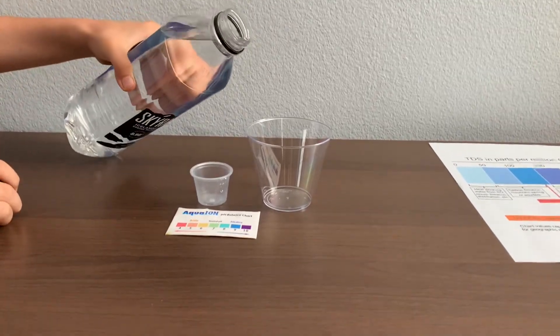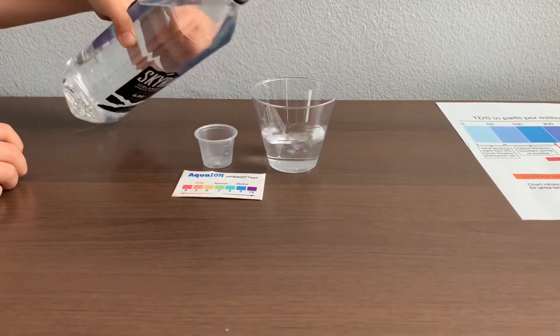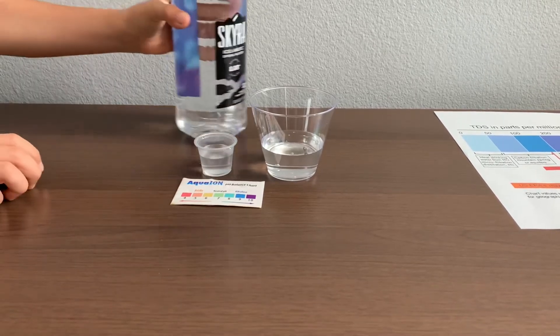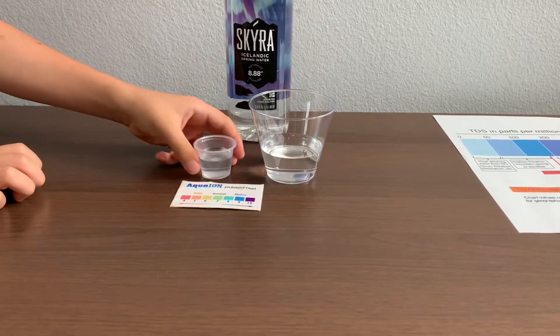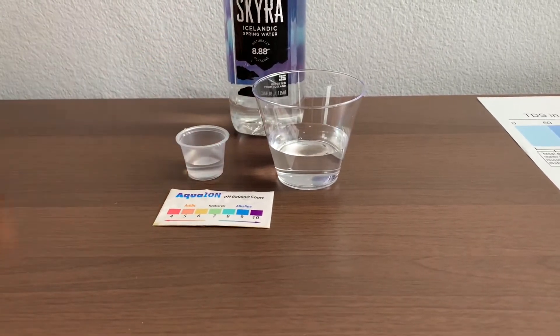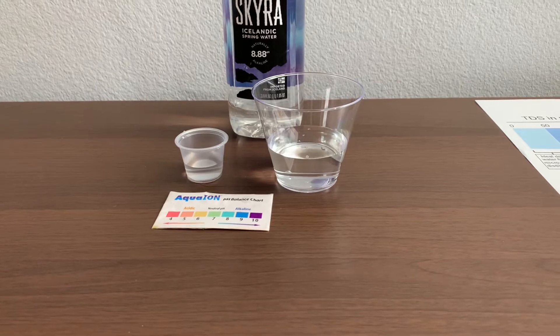Let's pour some water in. This is a little too much for the pH cup, so let's pour some back in for the TDS. First, we're going to test the TDS level.